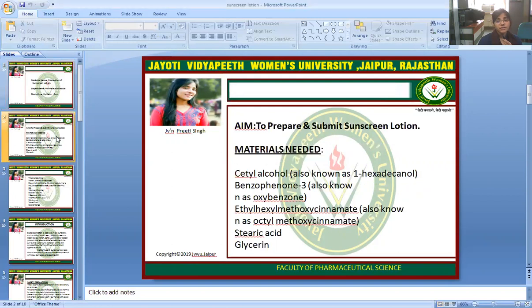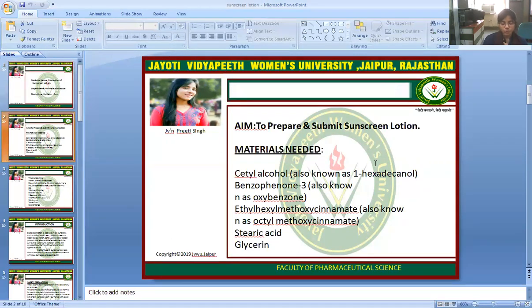Today's aim is to prepare and submit sunscreen lotion. Firstly, we will discuss the introductory part. Prepare a 0.10% solution weighed by volume of your assigned commercial sunscreen lotion in N-propyl alcohol. Weigh 0.050 grams of sunscreen lotion into a 100 ml beaker, add 50.0 ml of N-propyl alcohol, and stir to dissolve the lotion. Label the solution with the brand name of the sunscreen product and its SPF rating.